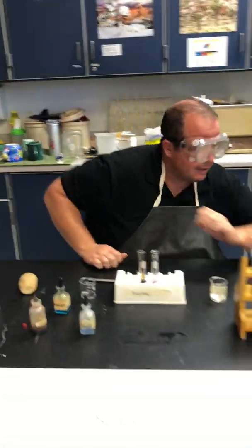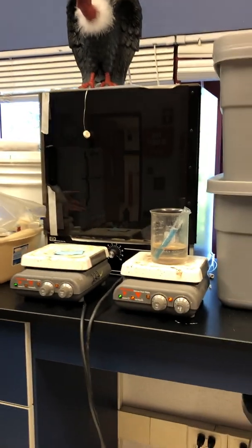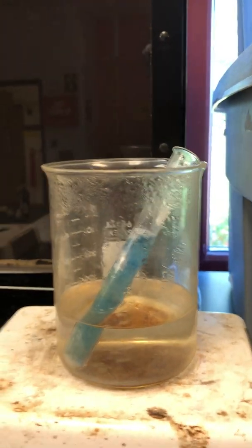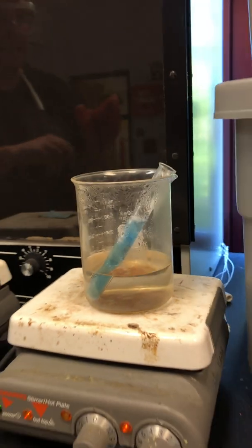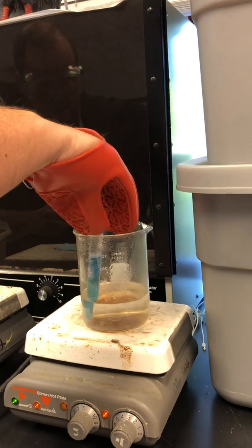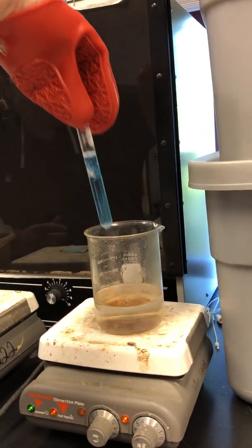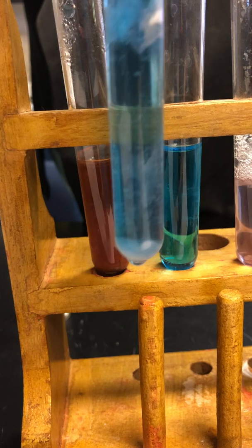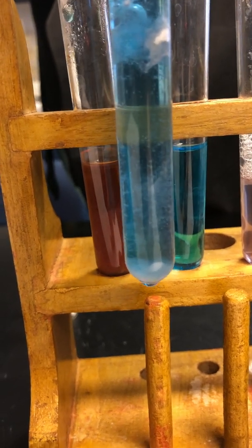Is it ready yet, Ms. Murdoch? All right, we let our tube relax in the warm water. I got to wake it up. I'm going to use the rubber glove, because safety first, ladies and gentlemen. All right, excellent. I'm going to take this over here to our tests. There you go. Which one does this look like? It's a beautiful color too. Yes, it is.